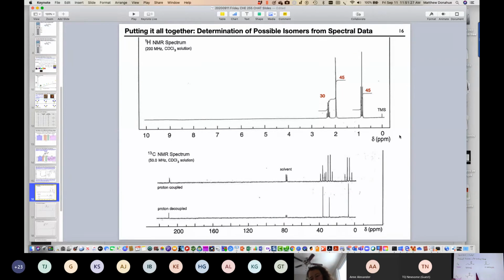Let's go through these and do the unique carbon count, the unique types of hydrogens, and then the ratios of the hydrogens. Then we're going to look back at this data, the proton data, the carbon data. The carbon data also has parts per million, but it runs from 0 to 220 in terms of the chemical shifts. So let's do this thought experiment first, then we'll look back at the data that's presented.